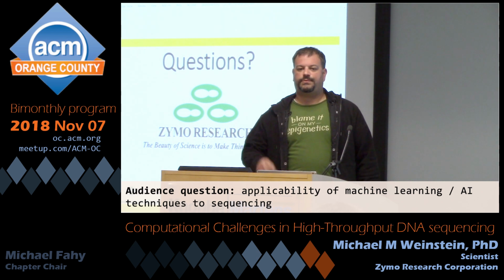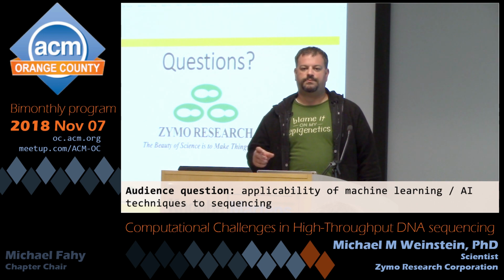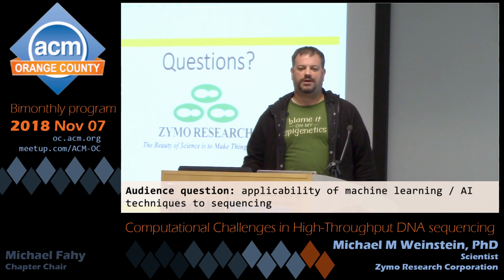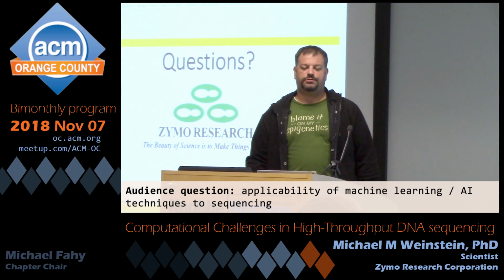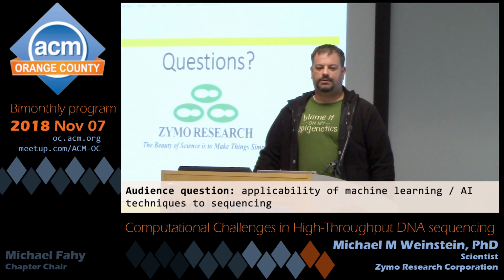It's saying, this variant is surrounded by 3 A's on one side and 3 T's on the other side, and I've seen a lot of other questionable variants surrounded by this pattern. This feature set, and it being in the middle of the read, suggests that it's probably a bad call. There are programs doing that kind of thing right now.